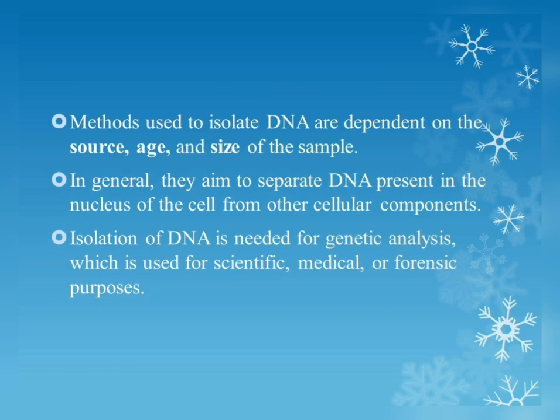Methods used to isolate DNA are dependent on the source, age, and size of the sample. In general, they aim to separate DNA present in the nucleus of the cell from other cellular components. The isolation of DNA is needed mainly for genetic analysis, which is used for scientific purposes, medical purposes, and forensic purposes also, like in labs.